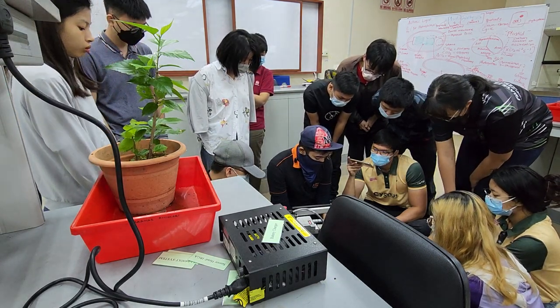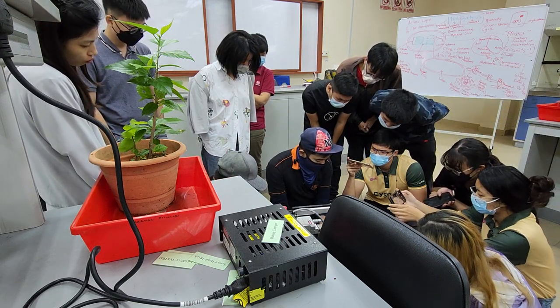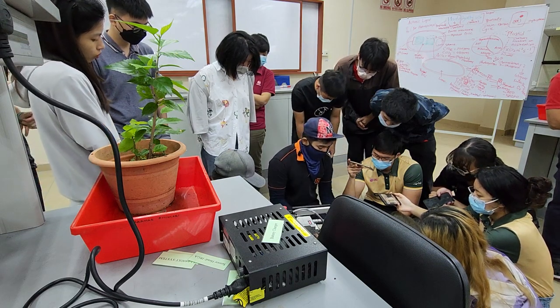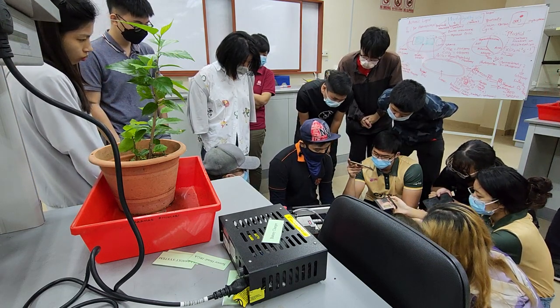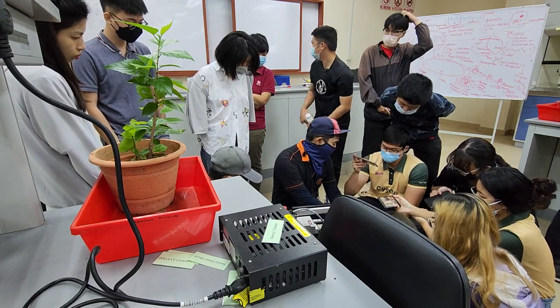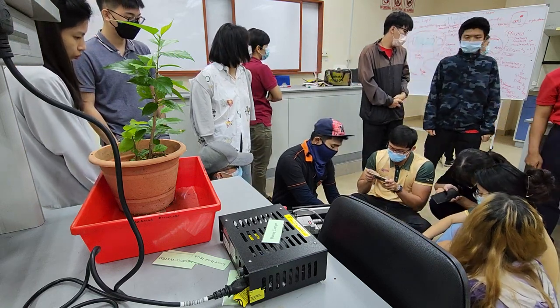So we are doing zeroing for all this. So no problem with water. Something not right with this soda lime. So we do. Wait. Yeah, I think better change. Okay. Can you get a container to contain this?